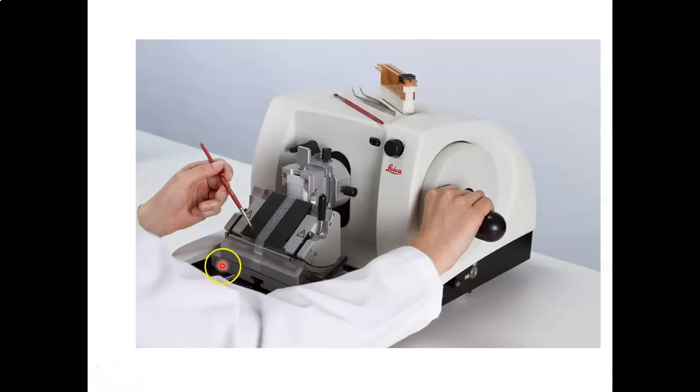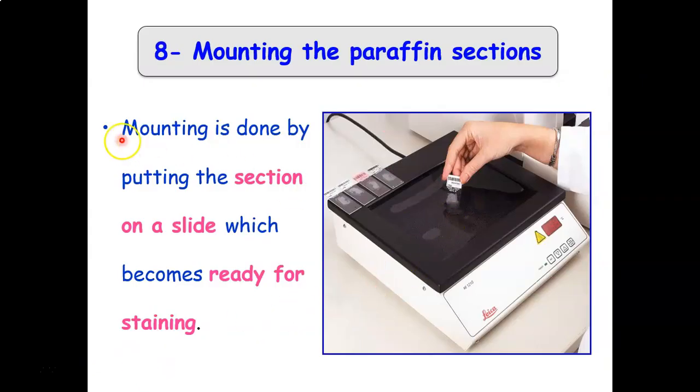I hope it will be clear. After that, I will put the serial sections into a water bath adjusted at 37 degrees centigrade, or warm water.